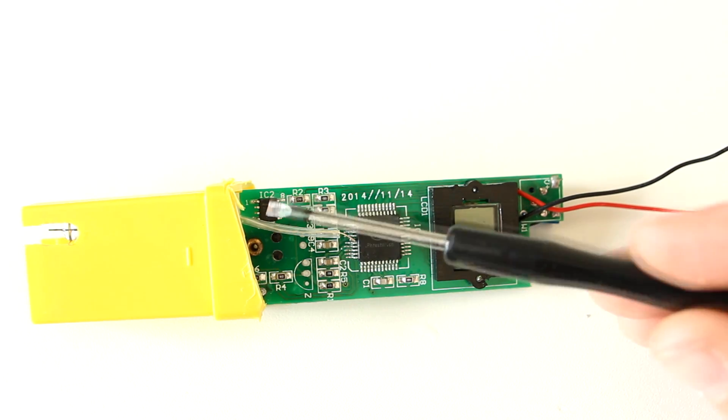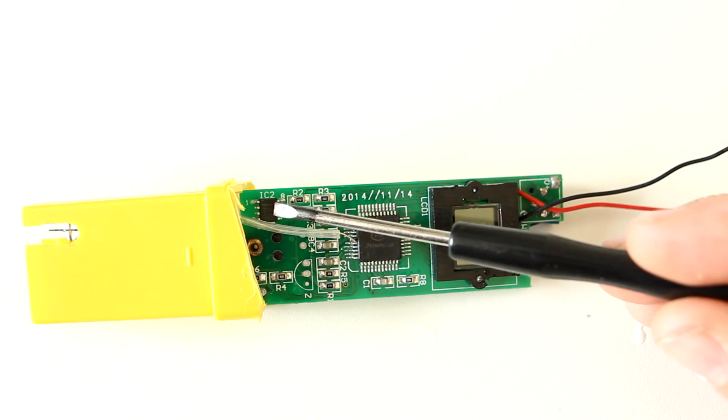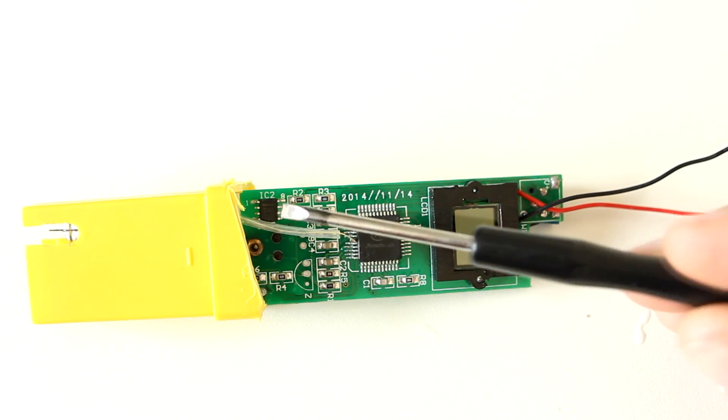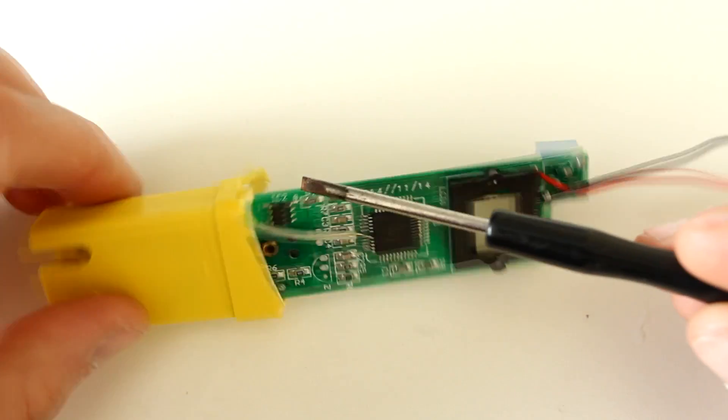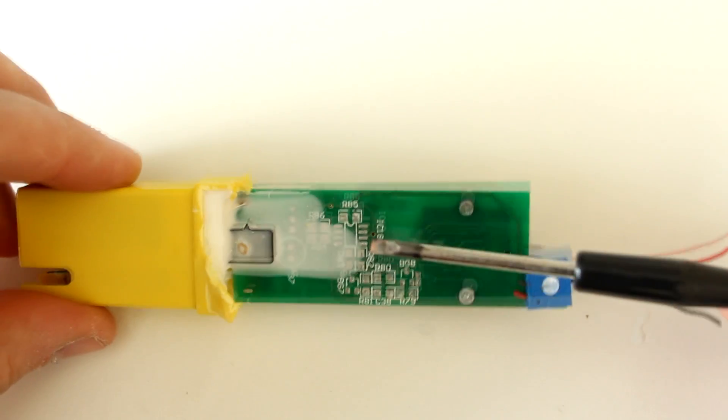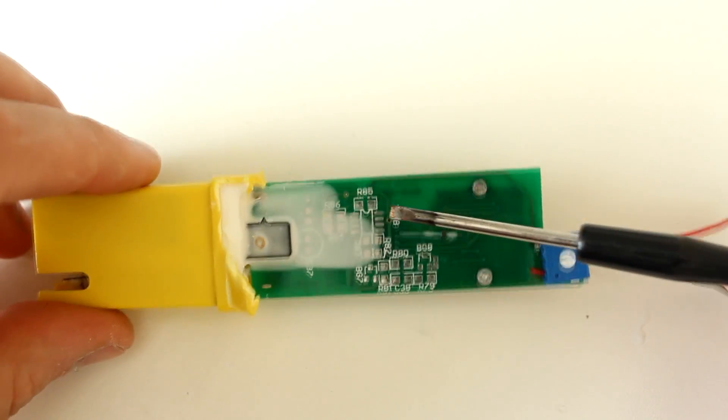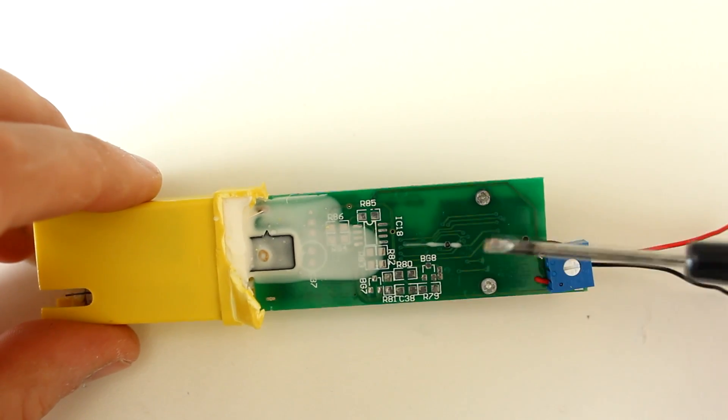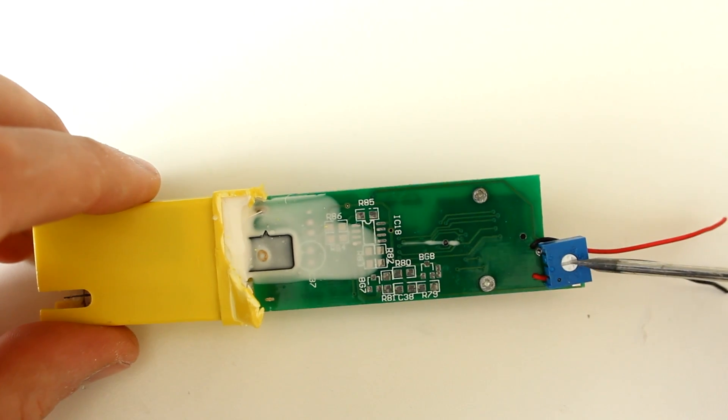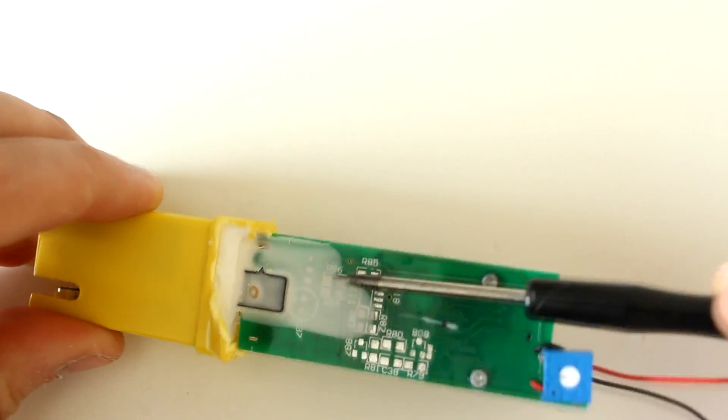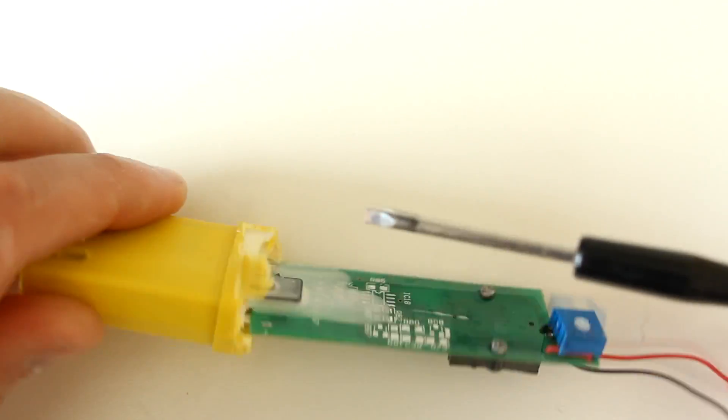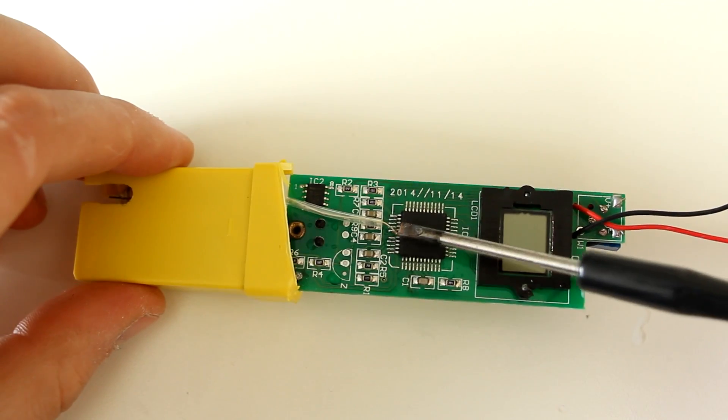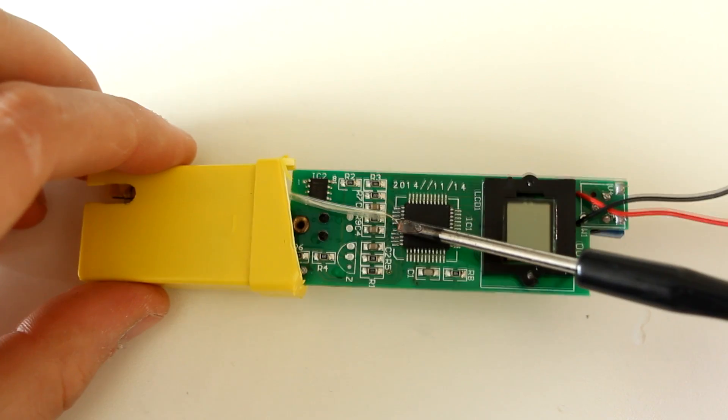A couple of passives and an LM358. On the back it has a lot of footprints for stuff but nothing actually on it, and it's got the adjustment pot.